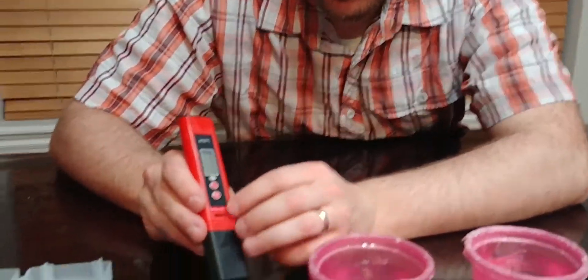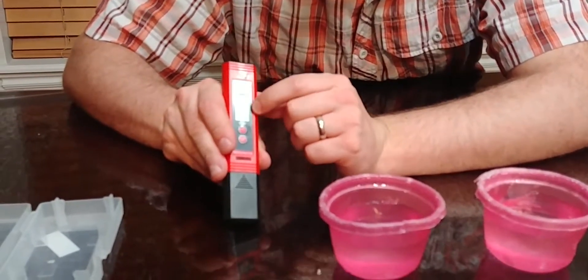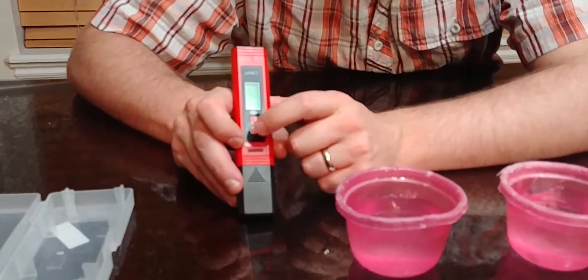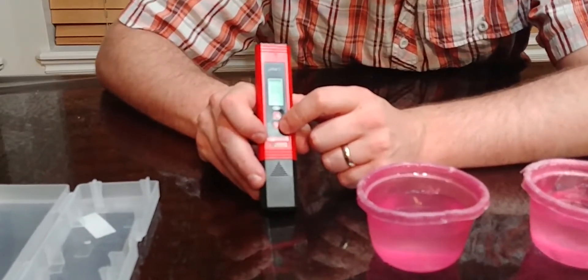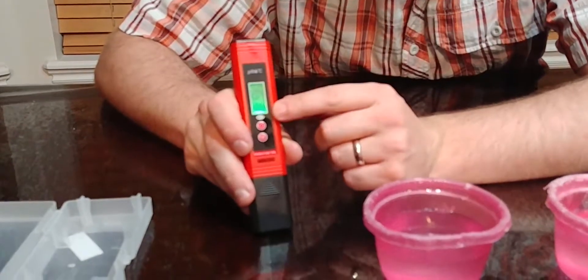All you have to do is hold this button for a couple seconds and it'll turn on. It'll show the temperature in Celsius or Fahrenheit — you just hit that button to change it. I think it's in Celsius right now, so I'll change it to Fahrenheit.